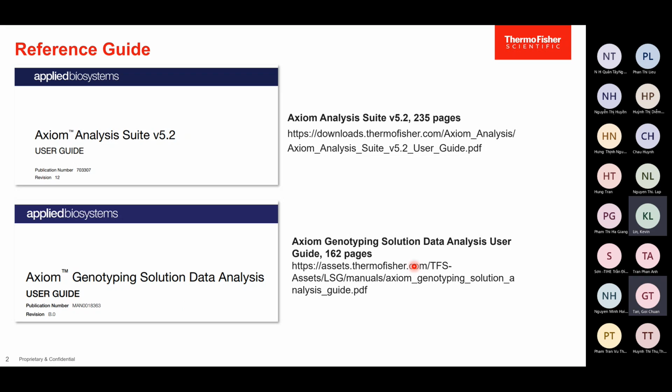Okay. And I think one of the very fast ways that you can access the user guide is, when you are in the software, you just click this button. This button, help. When you click this button, right?